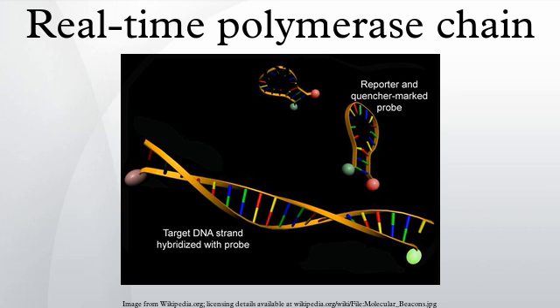Although cycle threshold analysis is integrated with many commercial software systems, there are more accurate and reliable methods of analyzing amplification profile data that should be considered in cases where reproducibility is a concern. Mechanism-based qPCR quantification methods have also been suggested, and have the advantage that they do not require a standard curve for quantification.